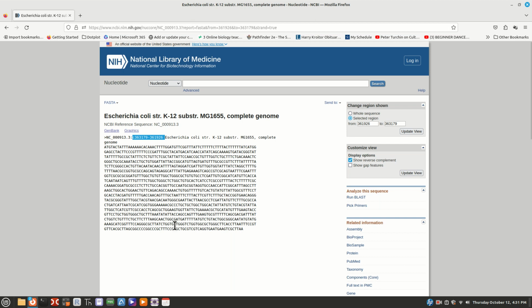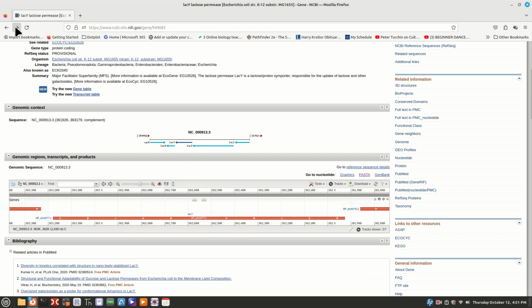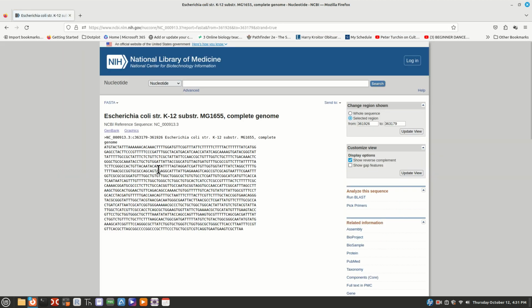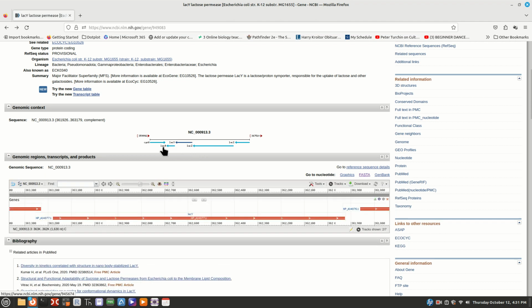So this is essentially our lac, and it does start with an ATG if you notice. So that's good. I think this must be the lac Y. Let's go see, what did we click on back here? Yes, we clicked on lac Y. Alright, so this is the lac Y. But we need to see, there might be areas in between these. So just because Y is here to here doesn't mean that absolutely lac A starts immediately or lac Z. We need to gather lac Y and get some overlap with here to make sure we get intervening sequences.